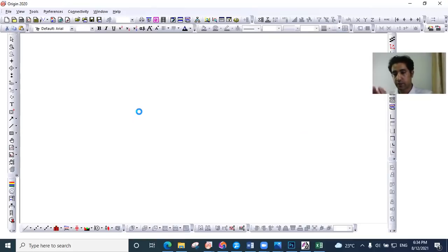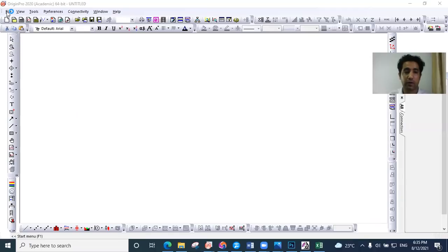If you want to see the statistics of the grains, you just click here, open Origin and click file. The computer is slow. Okay, click file.